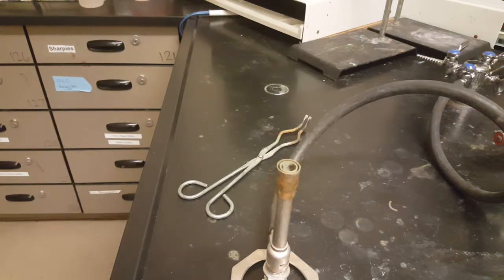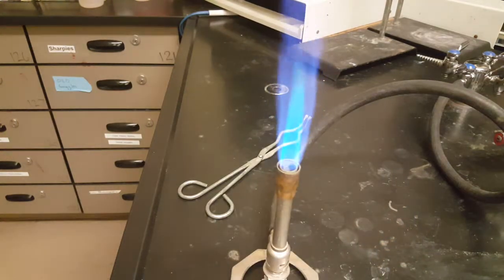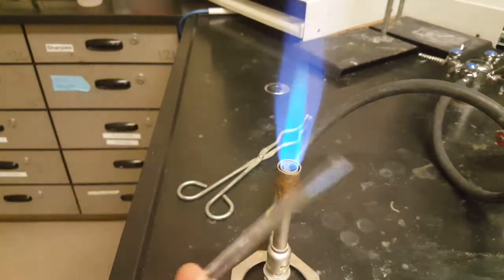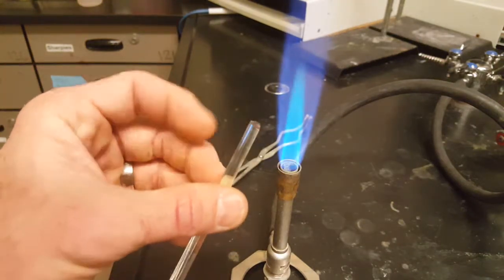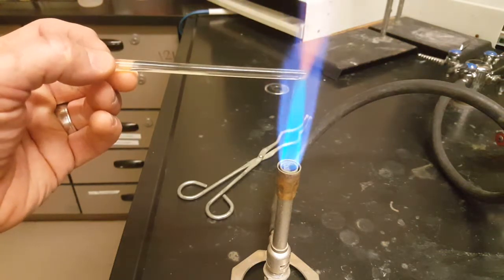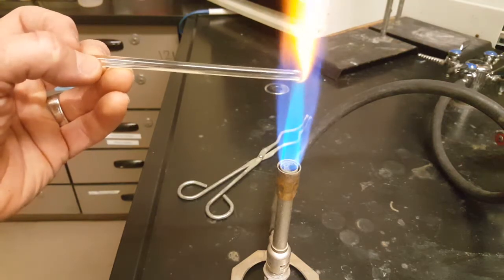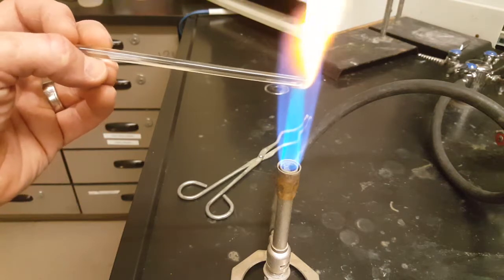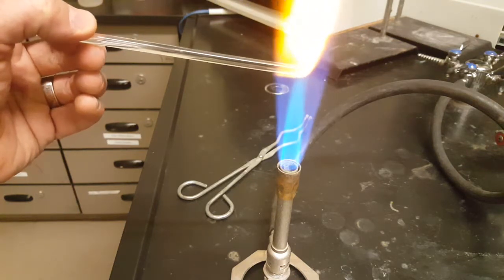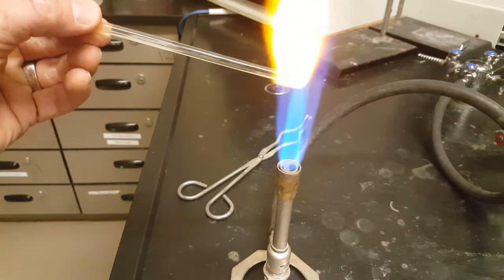Go to your lab bench and fire up your Bunsen burner. You want to soften the ends of these glass stir bars by putting them in at the very top of the inner blue flame, where it's about 1100 degrees Celsius. Keep the glass rolling around, and the glass will slowly turn into a fluid and soften, so it'll be safe to use.